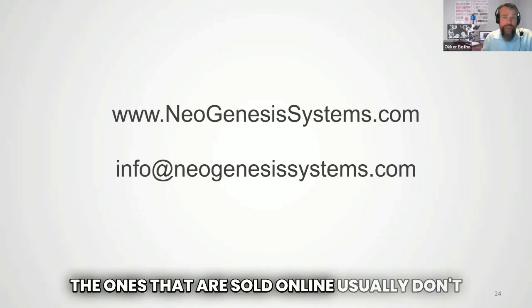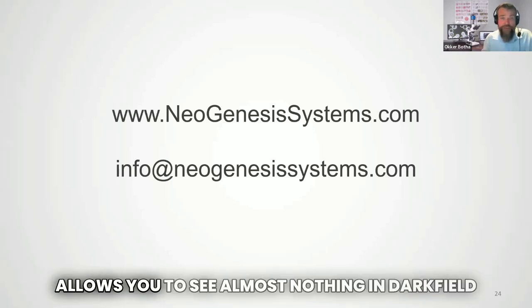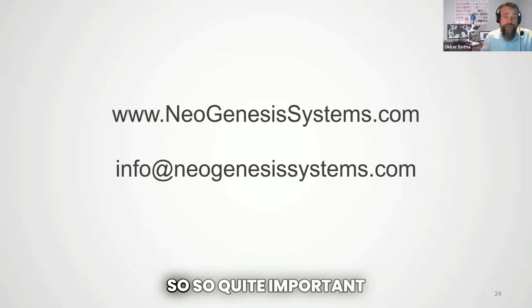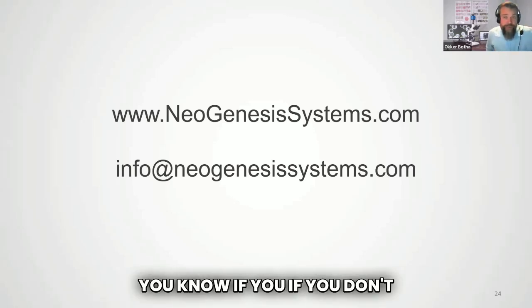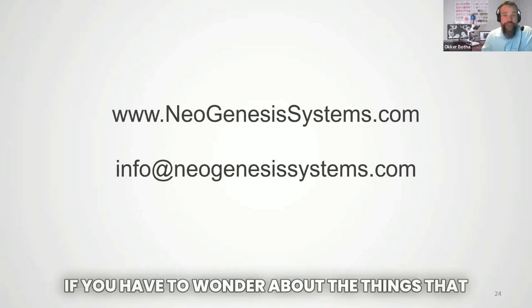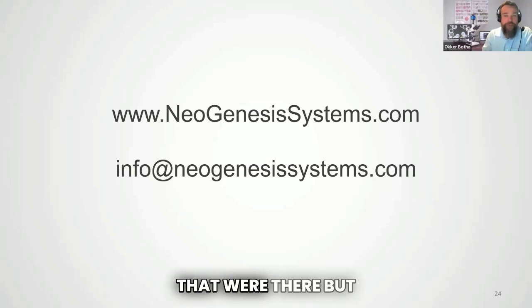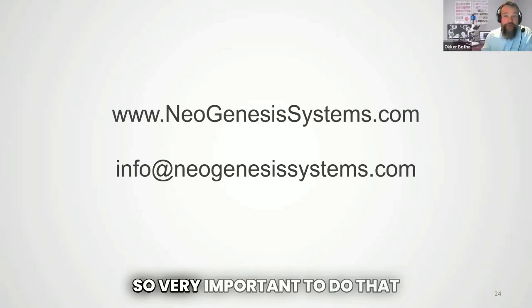The ones that are sold online usually don't have the right light source, which allows you to see almost nothing in dark field. And there are lots of other things to look at as well. So it's quite important to get that right. If you don't have the right specifications, it's quite difficult. It can be a cause for sleepless nights if you have to wonder about the things that you might have seen in the sample that were there, but just were not visible because of your microscope. So it's very important.